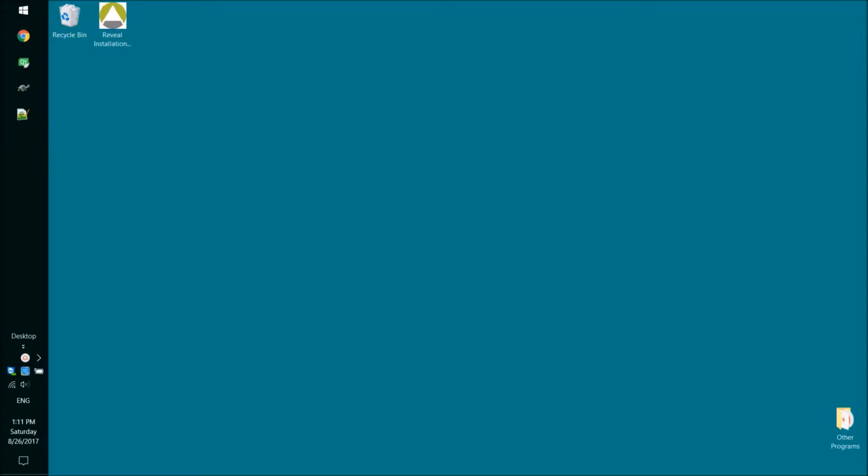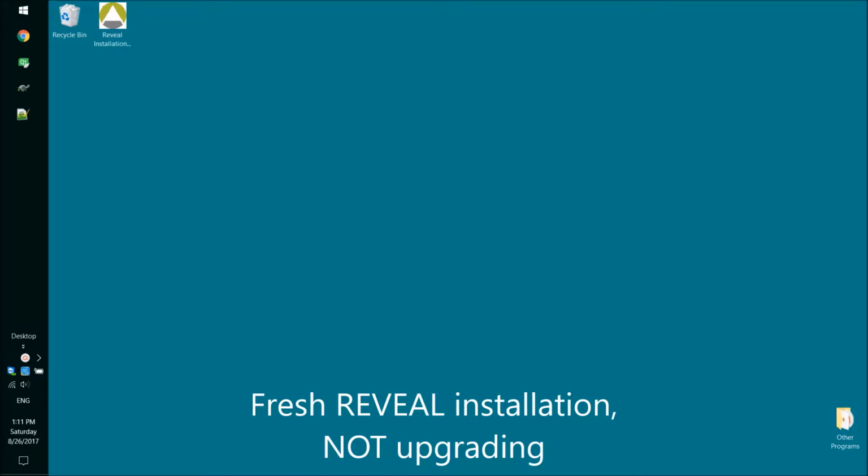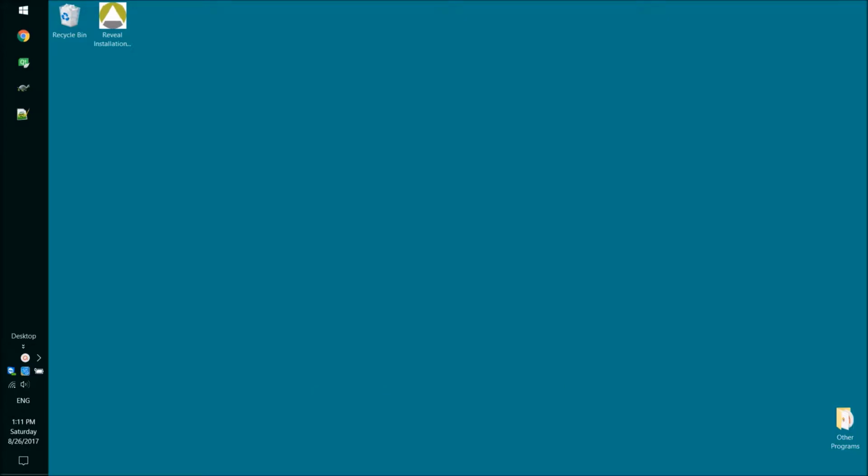In this video, we will show you how to install a new copy of Reveal on your computer. Please note, this video covers the installation of a fresh copy of Reveal, not upgrading an installed copy. Start by running the installation program that you can obtain from Apre Instruments, typically via a web download link.